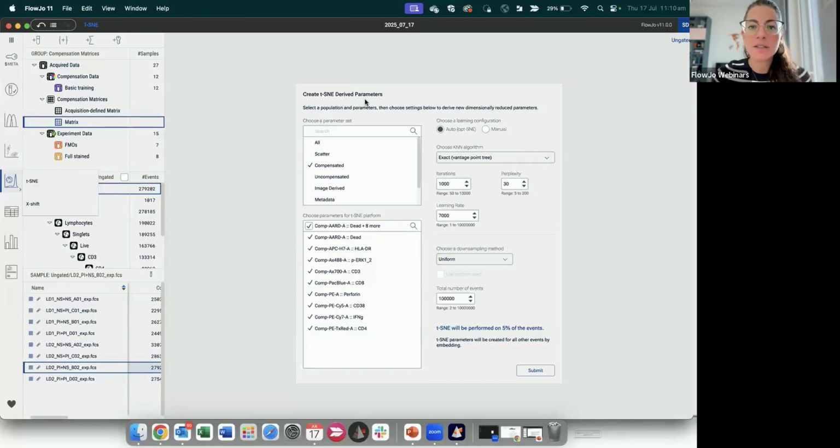Is the statistical test also testing if the test can be applied? Not sure I got this question right. Yes, it should be testing if that can be applied or not. If it cannot be applied, you should get an error.